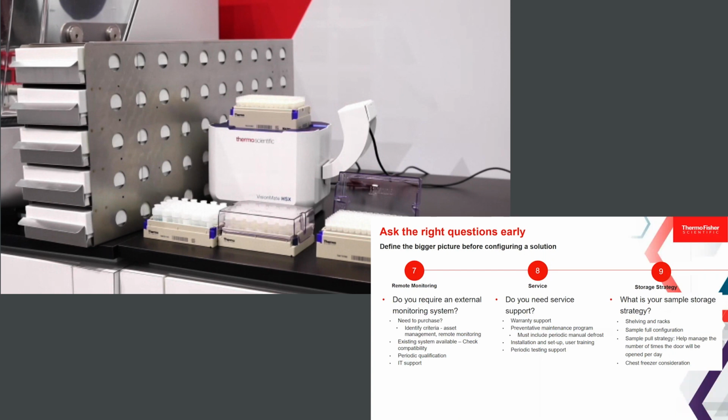So what does that do? That helps you find what you need quicker, so your door opening time is shorter, but it also helps you keep organized so that you know exactly what's in every single box in your freezer, exactly where to find it, so you have an easy inventory at any time. And this is critical when it comes to actually operating your lab, right?